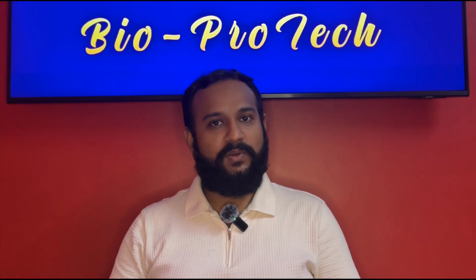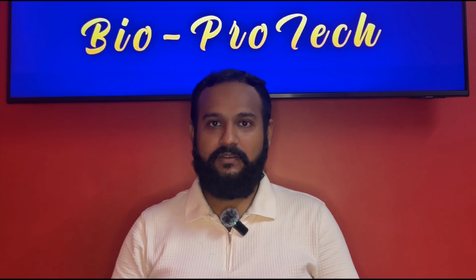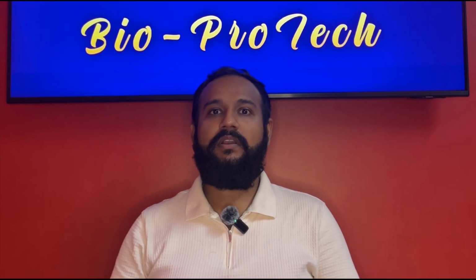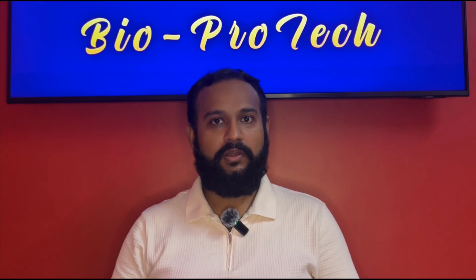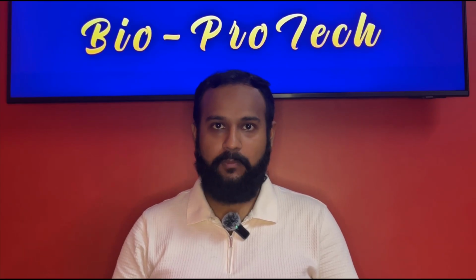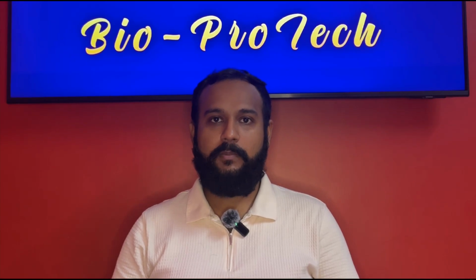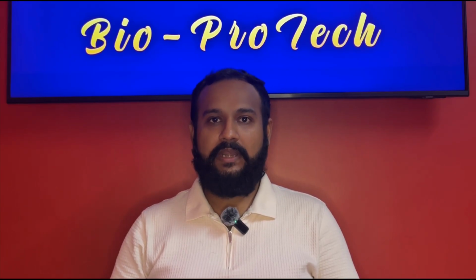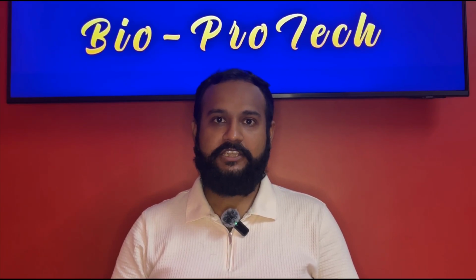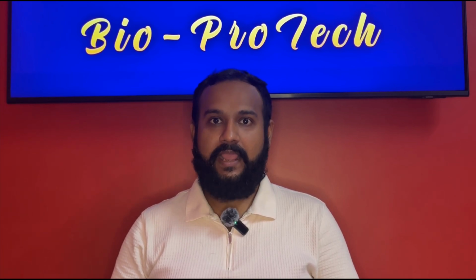So in today's demonstration video, we'll be looking at PyMol. That is basically a visualization tool. I will go in depth on PyMol. I will start from the absolute basics of how to install PyMol. Then we will look at what PyMol is capable of, and how you can utilize it for visualization of your protein structure, ligand structure, and the interaction of those structures.